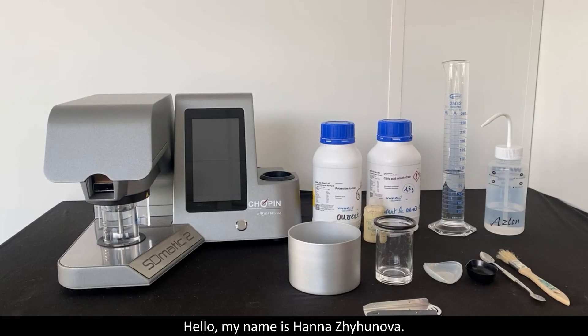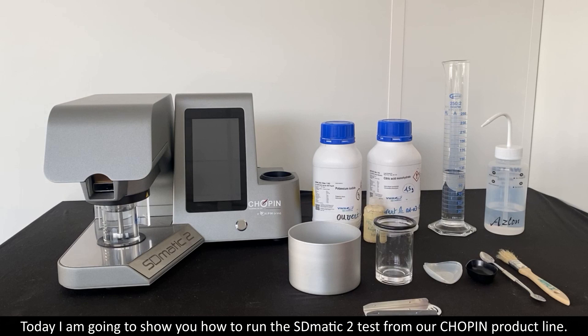Hello, my name is Hanna Zhigonova. Today I'm going to show you how to run the SDmatic 2 test from our CHOPIN product line.